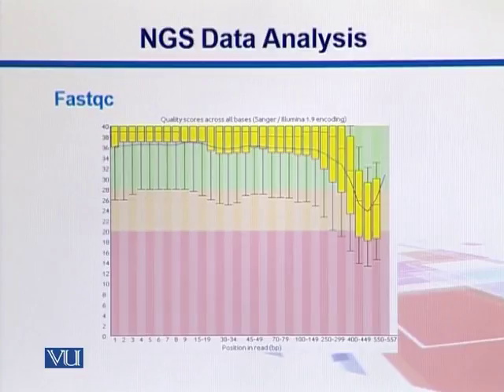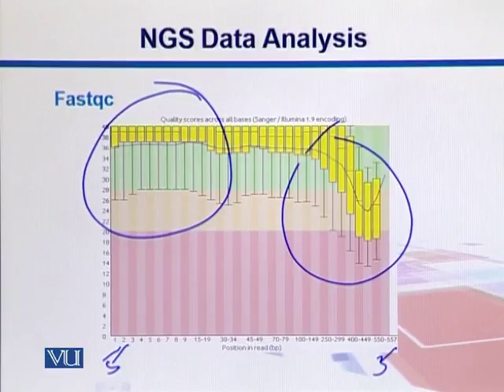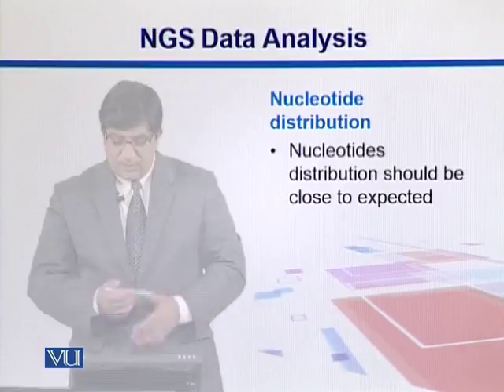Again we see that the sequencing quality is good as far as these starting reads are concerned, and it's bad towards the other side. So what we can do here, while looking into this data, is maybe go up to some level. For example, from here the minimum scores are 20, and below that we can see that there are some reads which are still performing badly. So maybe we can clip those regions, and not include them in the future analysis.